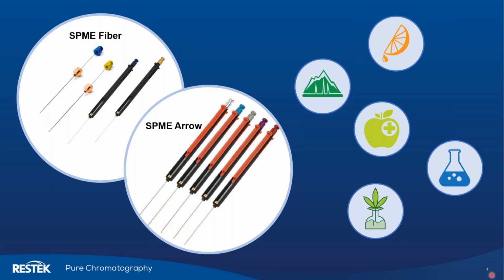So some really common places that this technology exists, if you're unfamiliar with it, is the food area and food safety. We can do both aroma profiling or flavor profiling of different foods. We can also look at compounds in the food safety area like pesticides, and then also in environmental, this has been heavily used for water analysis, whether it's semi-volatiles or volatiles. But really, this technology can be applied in many different spaces, which makes it so versatile.